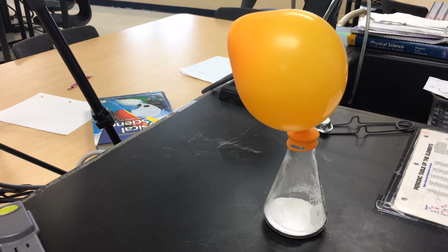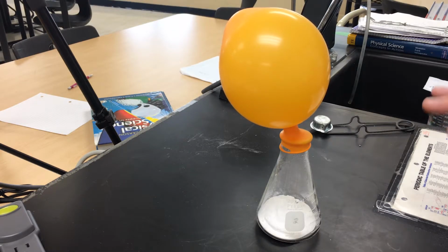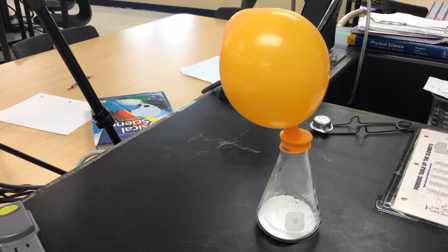So we let this sit as long as the balloon is not going to get much smaller than this, if it gets any smaller at all. So that's it. That's the reaction of sodium bicarbonate decomposing in the presence of heat. Now, this is not a bizarre, unusual chemical reaction. In fact, this is the chemical reaction that accounts for the fluffiness of your cake batter, anything that has baking soda in it. When the temperature reaches the cooking point, the carbon dioxide is released, and that's why your cakes rise and things like that.